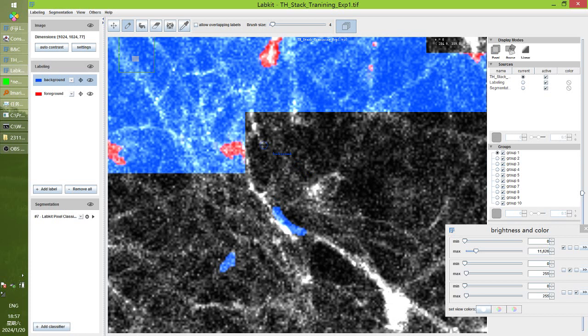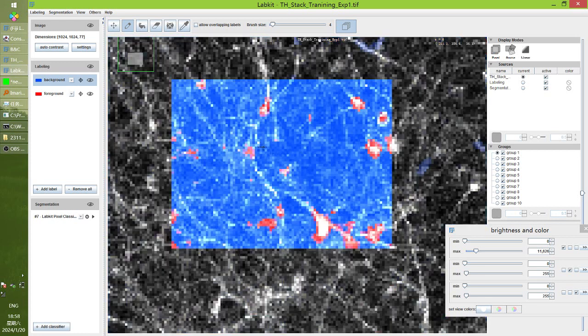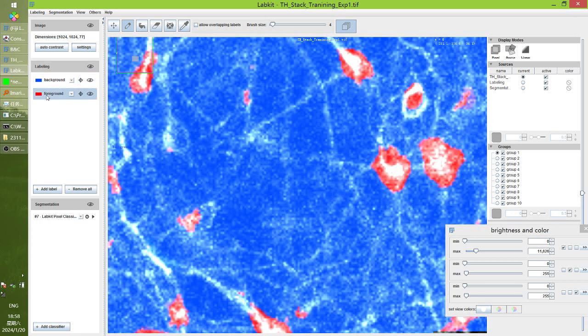It's unlike the static staining with a clear boundary, with so many fibers, and the fibers are strong and the cell bodies are so weak, so this caused a lot of problems. And we fill up these cell bodies and use the eraser to clear this over. Sometimes you find the eraser cannot erase this out.